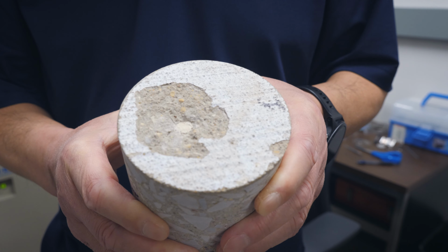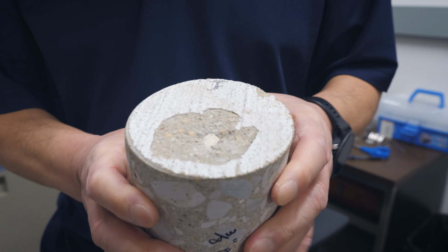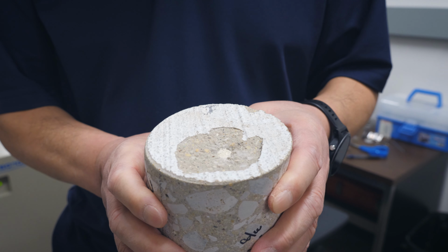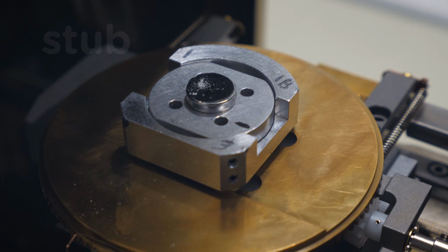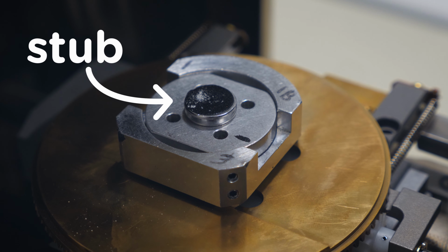This core was taken from an airport pavement. Less than 24 hours after the concrete was placed, the surface started to flake. Earlier, I transferred a small amount of the material onto this stub. Now I'm ready to run the scanning electron microscopy analysis.